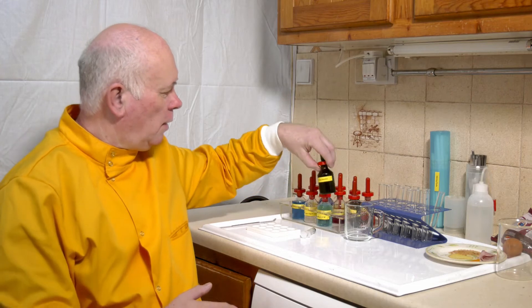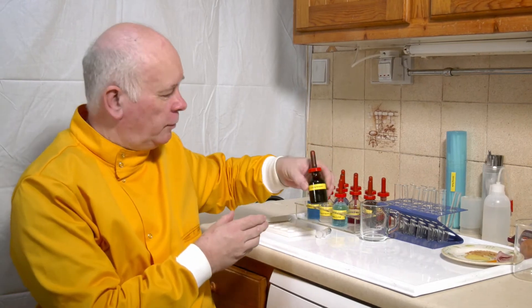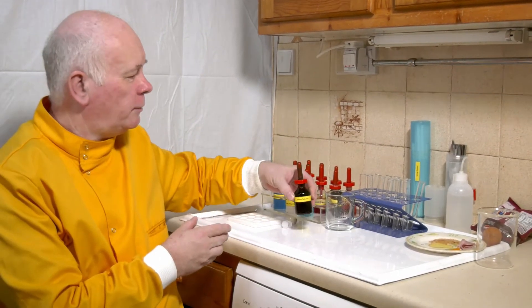We're going to have a look at food tests. There are a whole variety of different food tests. The first one we're going to look at is for starch, and I'm going to use iodine solution.